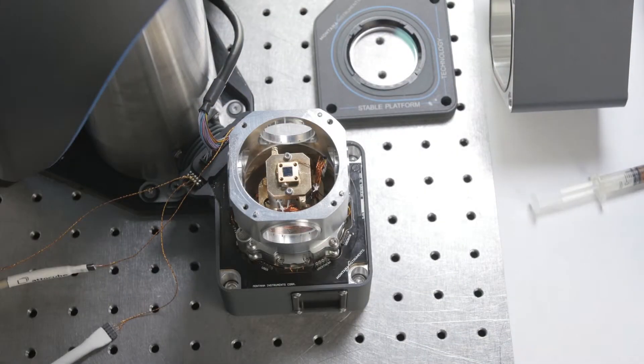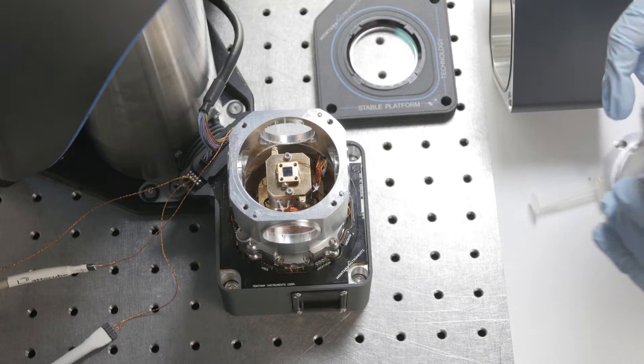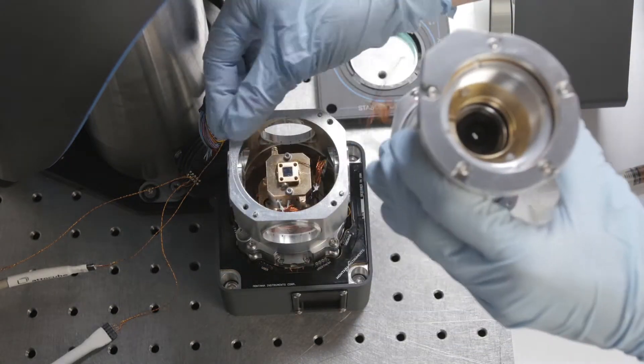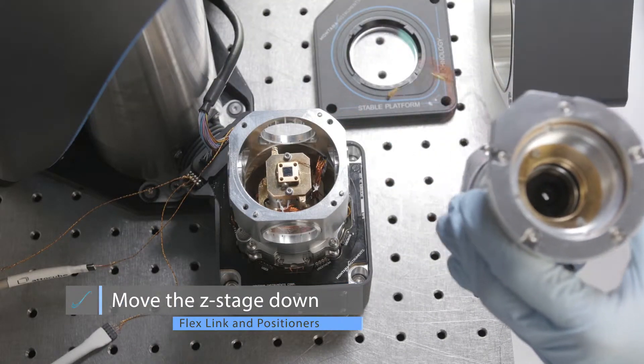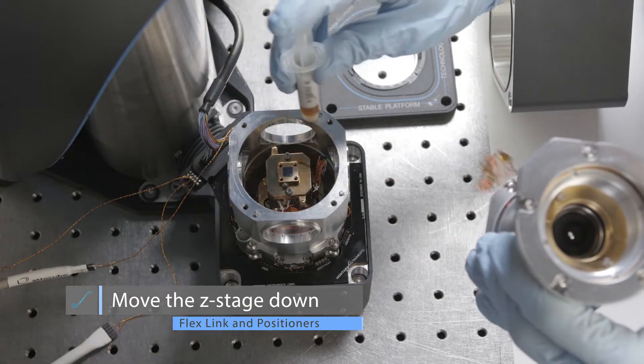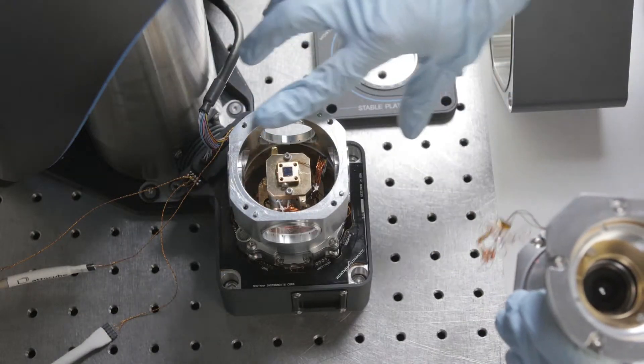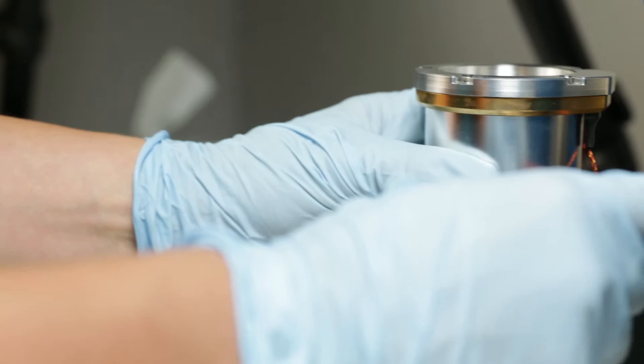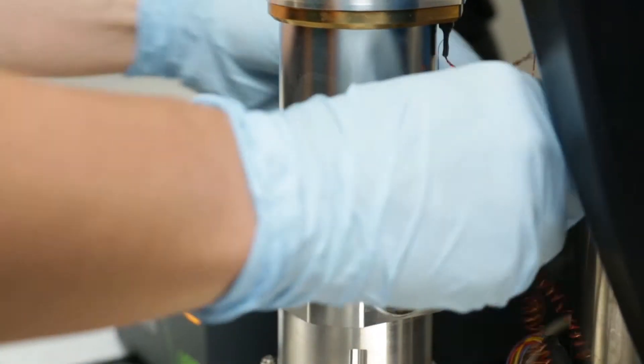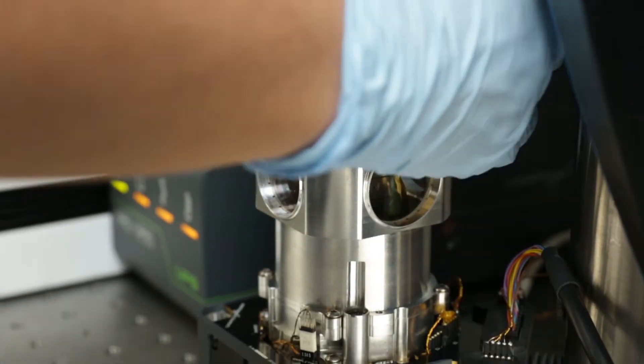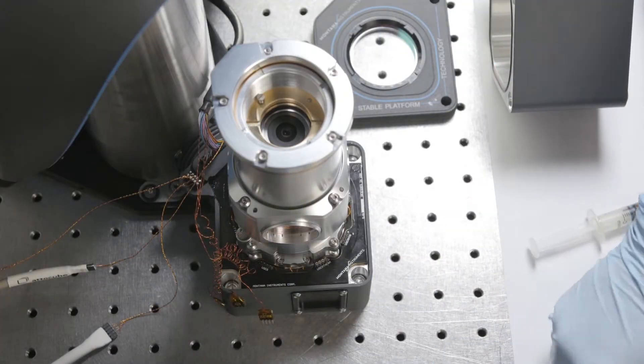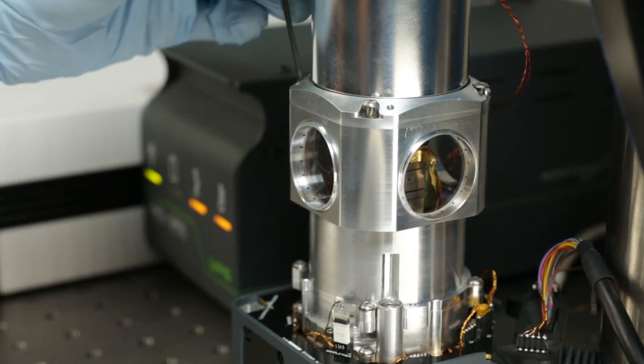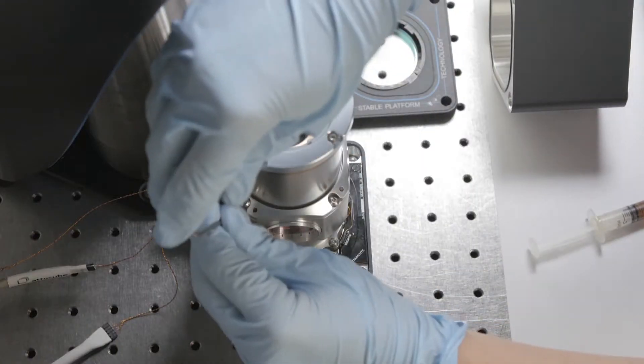Finally, we'll put on the cryo-optic holder. Make sure your Z stage is all the way down so you don't run the aperture into your sample. We'll also want to add a thin layer of N-grease. We'll tighten these screws down, also M3 by 8 cap screws with Belleville washers.